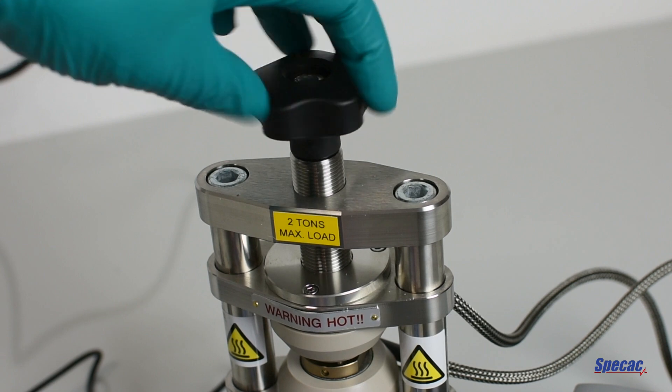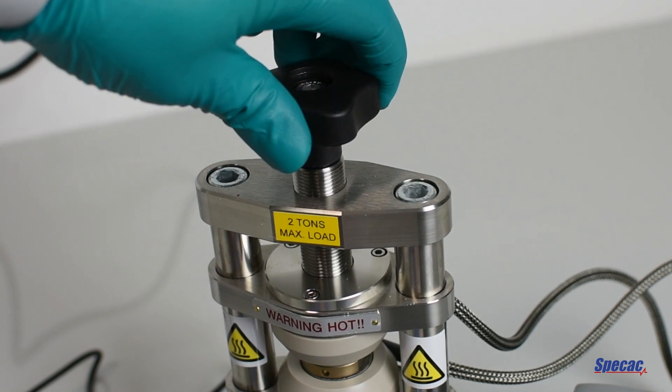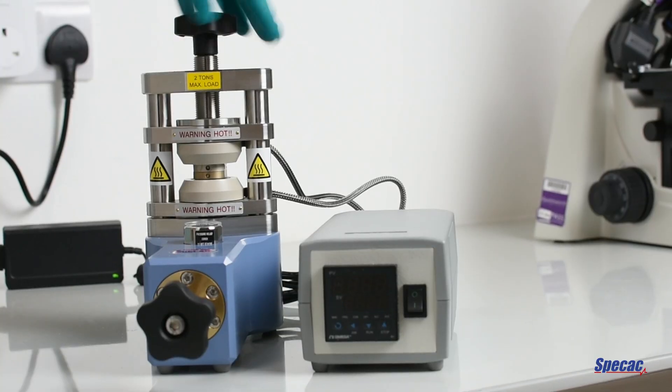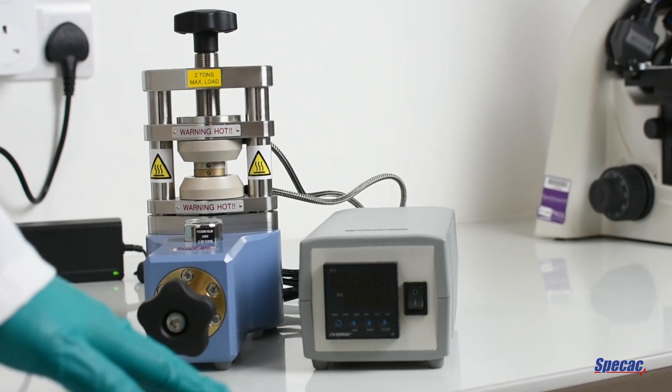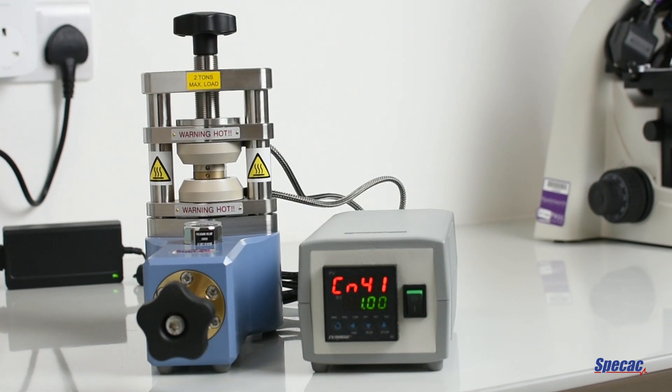The procedure begins by setting a temperature on the press. Before setting the temperature, ensure that the heated surfaces of the press are touching by rotating the lead screw until they meet. After the heated surfaces are brought together, flip the switch to turn on the temperature control.